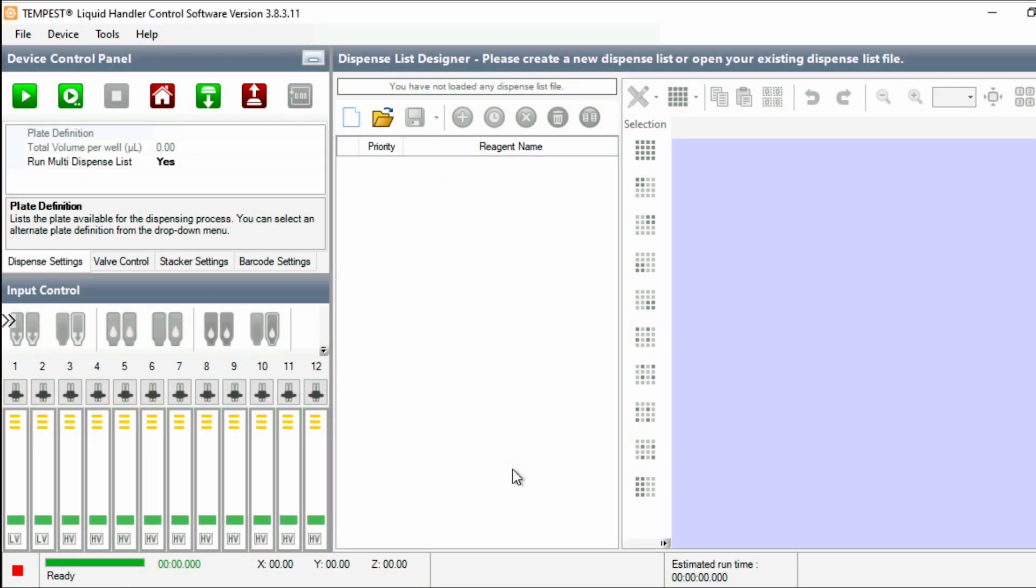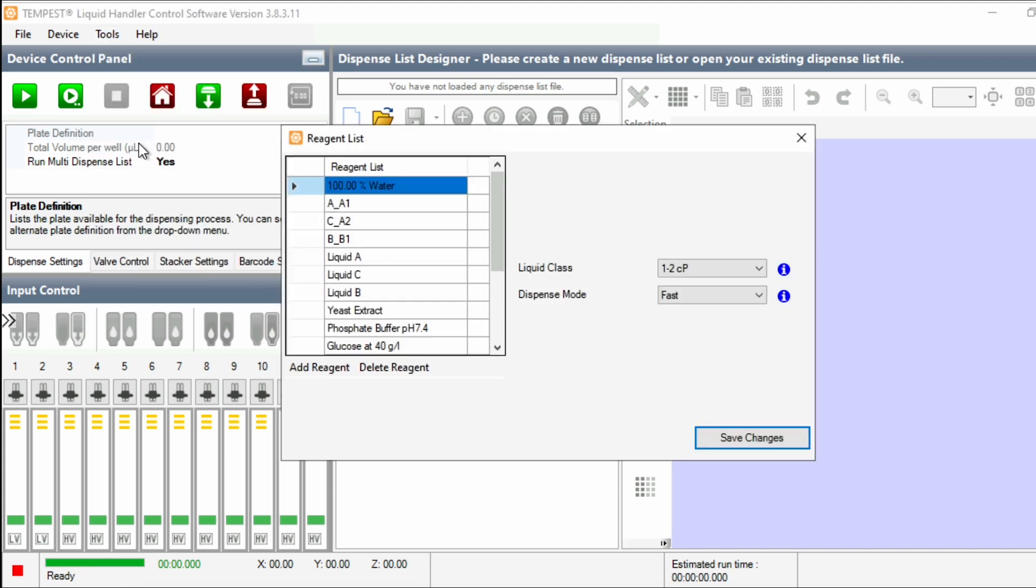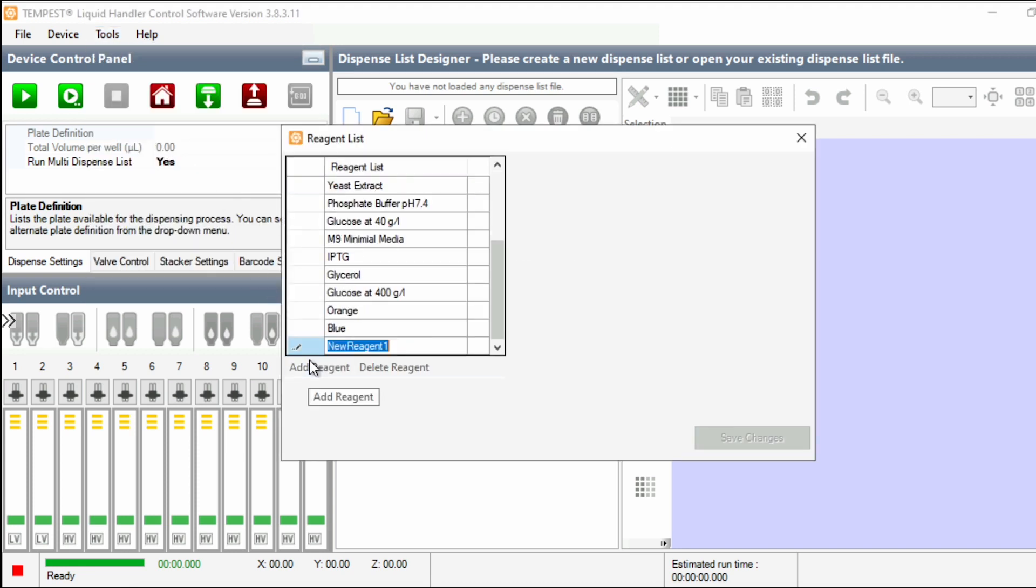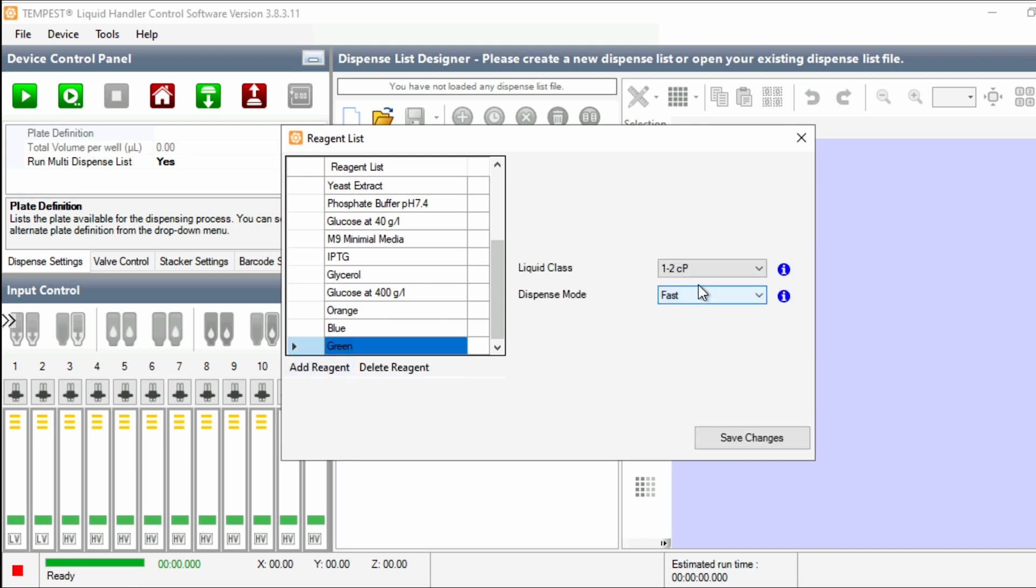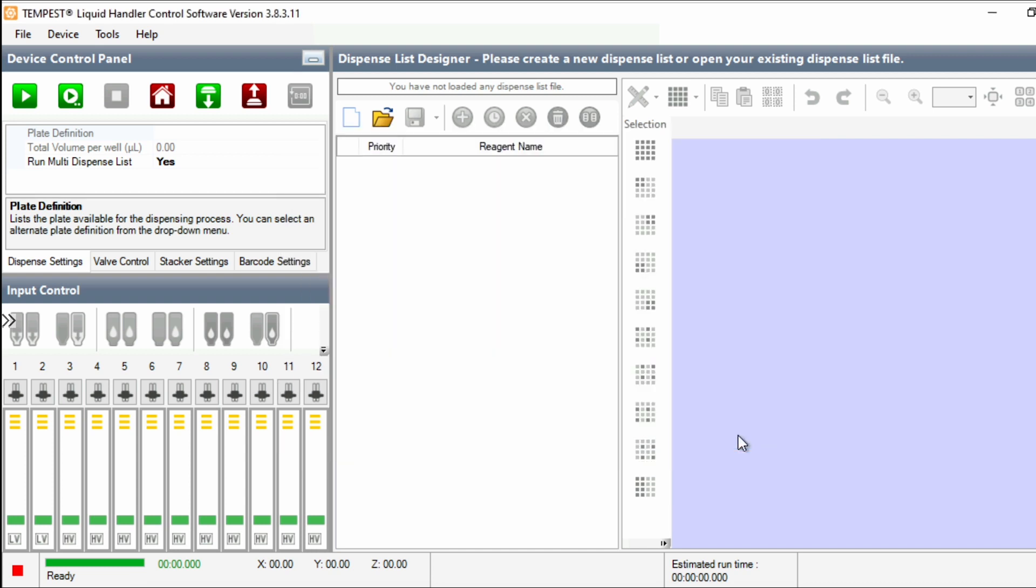Every liquid you use with your Tempest will need to be added to the reagent list in the Tempest software. To add your liquids to this list, click Tools, Reagent List. Add a new liquid, assign a viscosity value, and a dispense mode. These values will define how the liquid is dispensed.